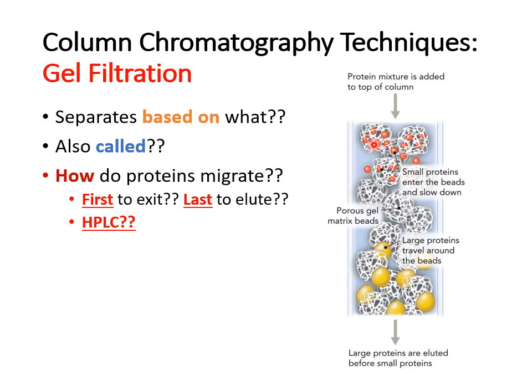One small protein will fit through the same small hole as another small protein. So HPLC lets you separate a little better, but it's also going to be a lot more expensive and more technical to use.